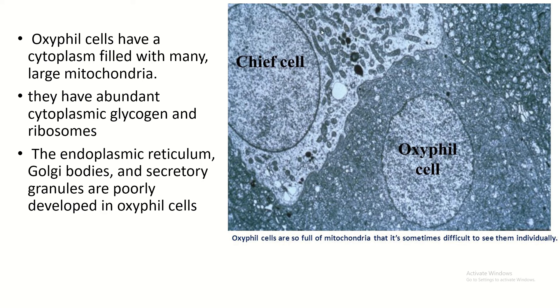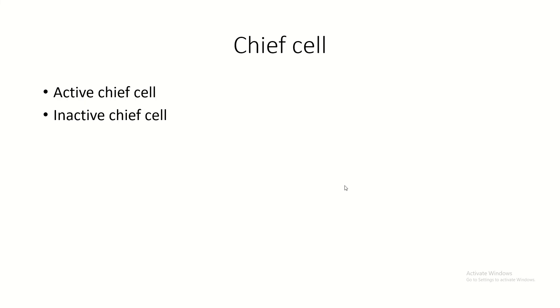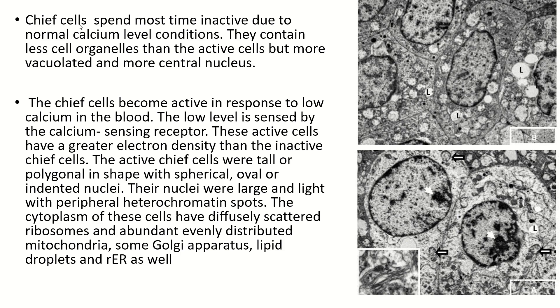This is the chief cell, and you can see the cytoplasm contains less organelles. Chief cells are two types: active chief cell and inactive chief cell. Chief cells spend most of their time inactive due to the normal calcium level condition of the body. They contain less cell organelles than active cells, but are more vacuolated with a more central nucleus.